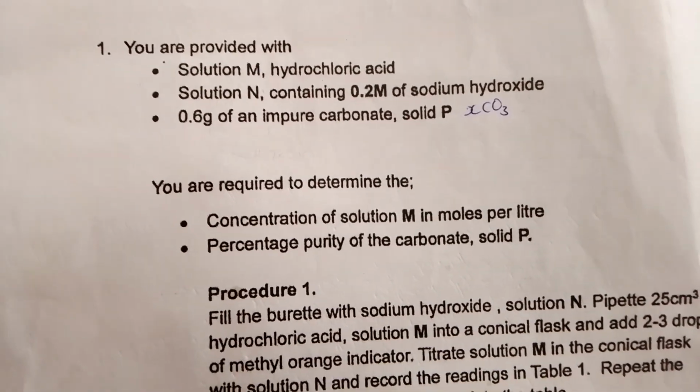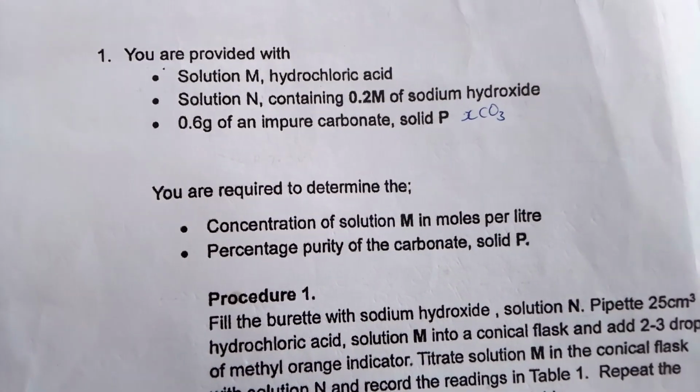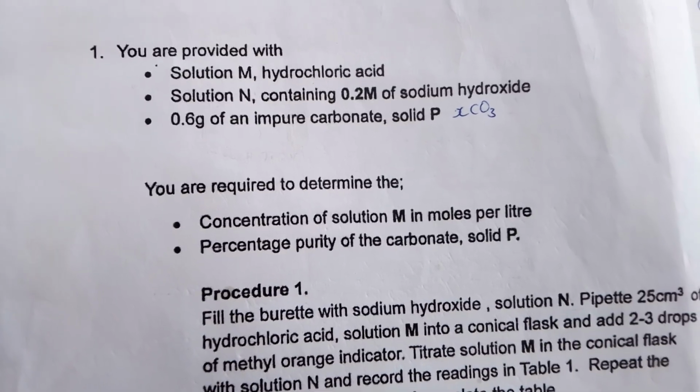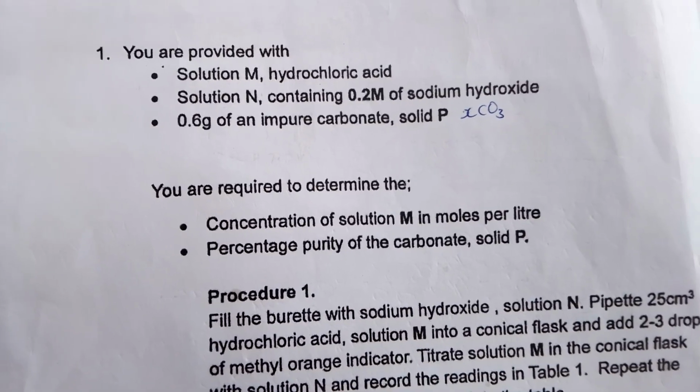Let me just go through what you are provided with, and then I take you through the procedure. One, you have the following solutions.